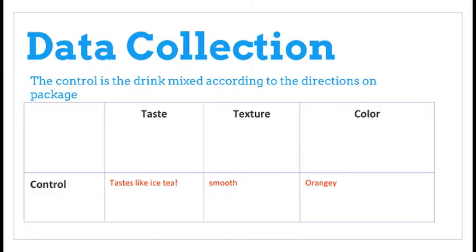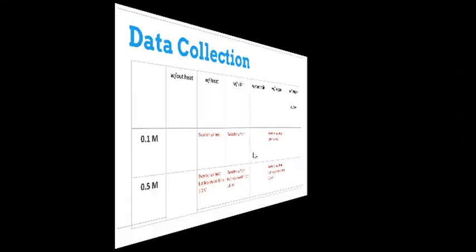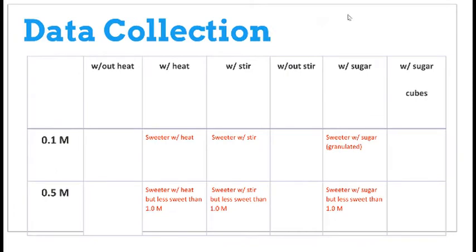Okay, I'm back and I'm feeling better. So let's go through the data collection. This is the information for the control, which I did not try on camera, but it tasted just like iced tea should. And this is the data collection from our lab.